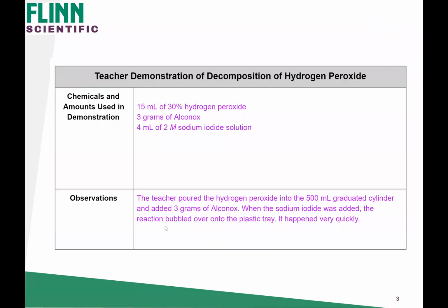Okay, so there is another example of a chemical reaction, and you can see that it happens at a particular measurable speed. You could actually take a stopwatch and count how long that takes. And again, if you're having trouble with the audio visual, I'm going to post these videos into the folder afterwards.